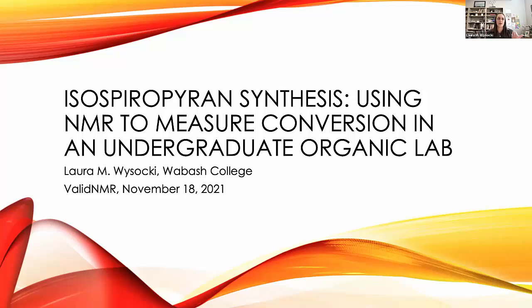to try to have students use that spectroscopy to really develop an understanding of how to analyze compounds, not just in the traditional kind of undergraduate curriculum, which is, here's an NMR, tell me what the unknown is, but instead as an analysis tool for all of the experiments that they do throughout the year-long curriculum.